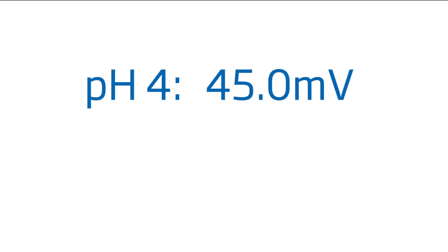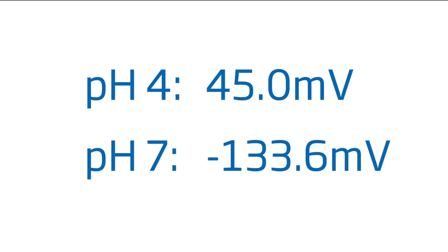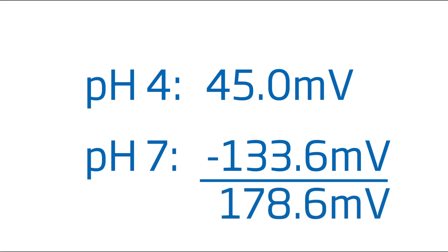To determine if your electrode has an acceptable slope, simply take the difference between the two buffer readings. We obtained a reading of 45 millivolts in pH 4 and negative 133.6 millivolts in pH 7, giving us a difference of 178.6 millivolts. Be mindful of negative numbers when performing this calculation.